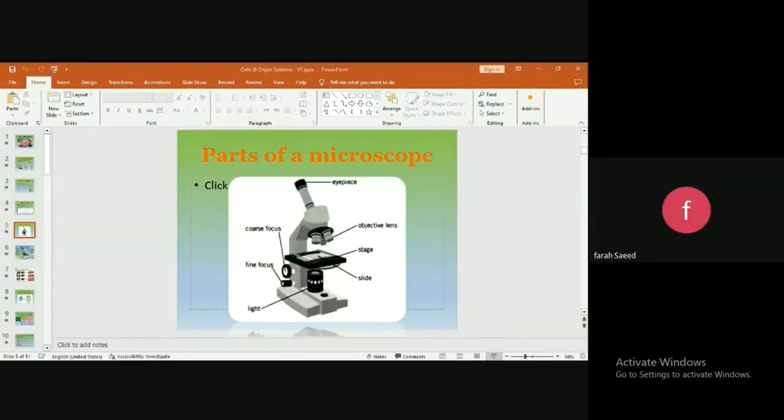This part of the microscope is called the eyepiece. You put your eyes through it to look at the cells, for example. Then you have three lenses here, three magnifying lenses.